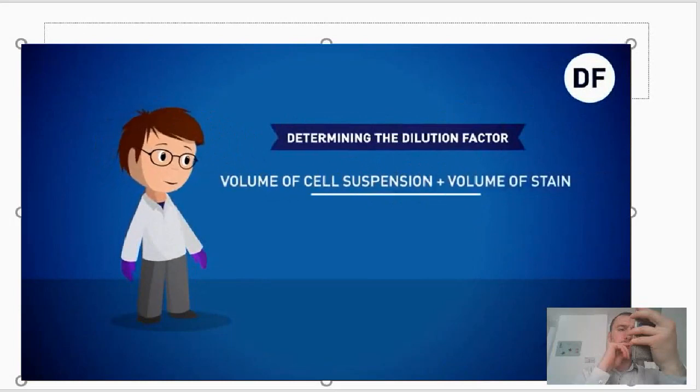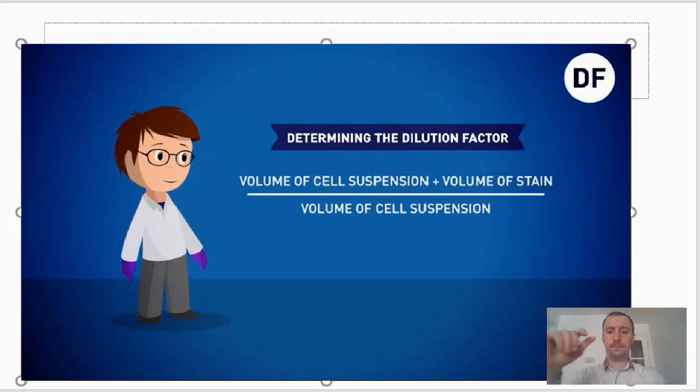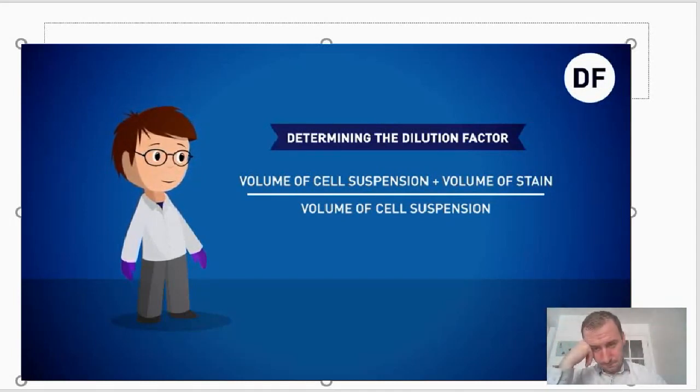To get accurate cell counts, it is recommended to have no fewer than 10 and no more than 50 cells over each square millimeter. Basically, you don't want to be counting 100 or 200 cells per square. You want to use appropriate dilutions to get 10 to 50 cells per square.